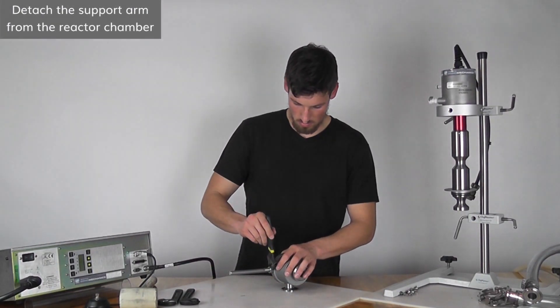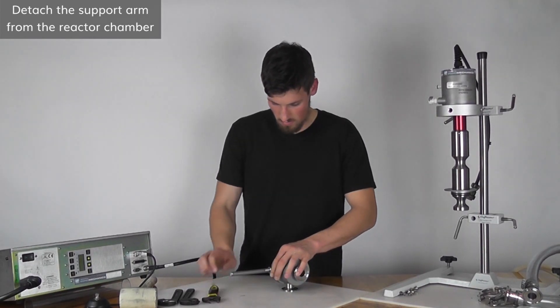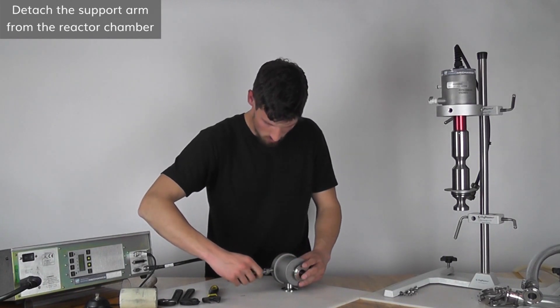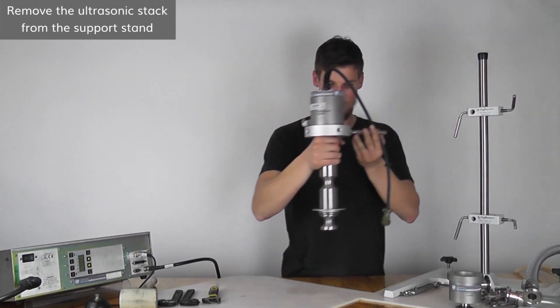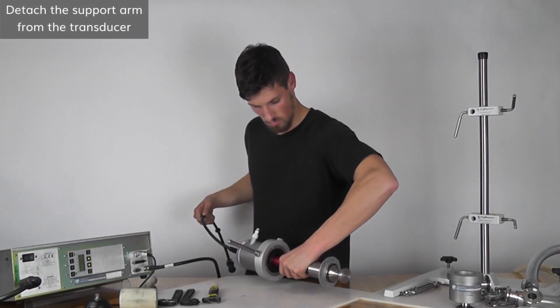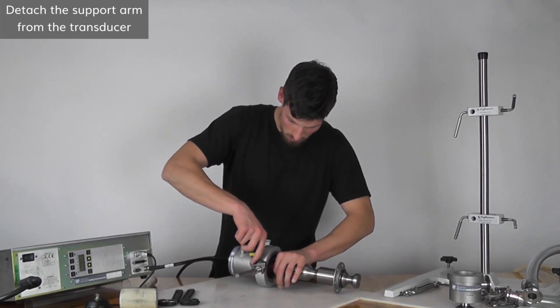Detach the support arm from the reactor chamber by using an adjustable wrench. Next, remove the ultrasonic stack from the support stand. Detach the support arm from the transducer by using an adjustable wrench.